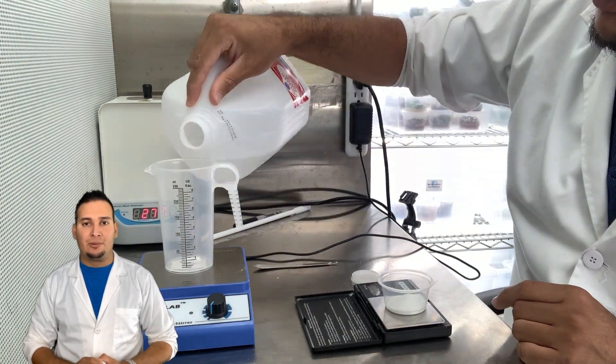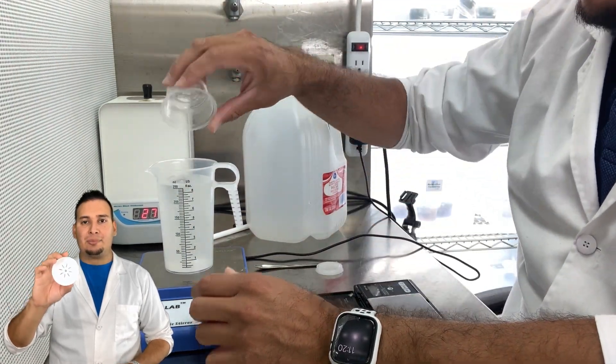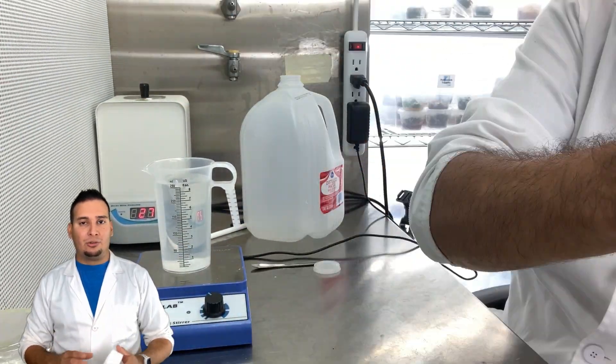Welcome back to another video. Today I want to show you how to use the BioCoupler temporary immersion bioreactor. The first step is to make tissue culture media, and the media is going to depend on whatever plant you're working with.